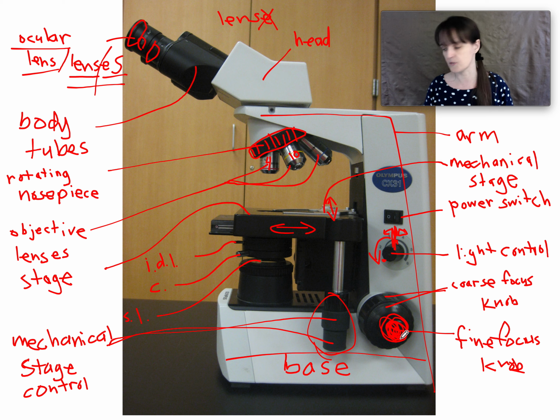So that's my trick. Now, sometimes I get the question, well, why don't we just start with the stage in the middle? Why do we have to start with the stage all the way down? So let me ask you this. If the stage is in the middle and it's not in focus, do you need to move up or do you need to move down? Right? How are you going to know? You're going to move up? Oh, it should be down. No. Start with it either all the way up or all the way down.